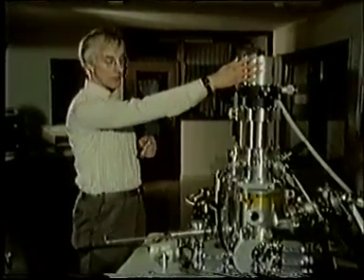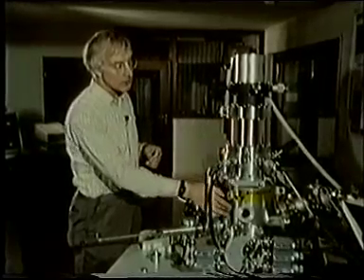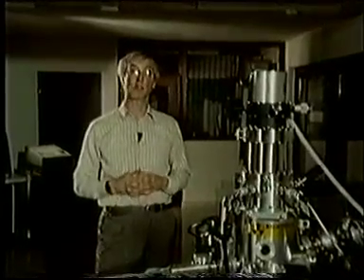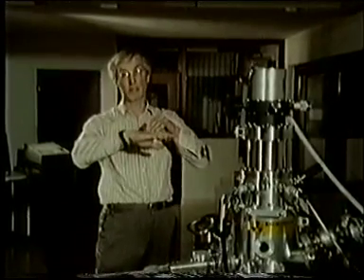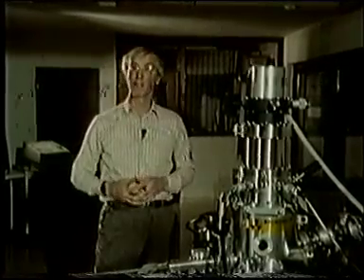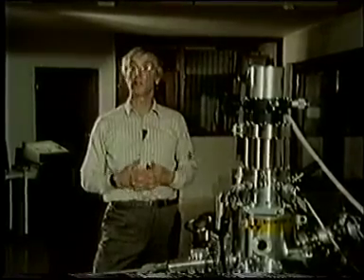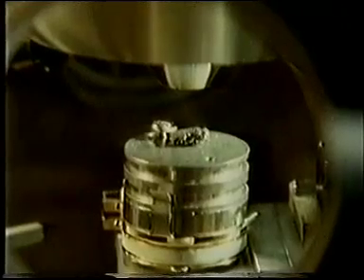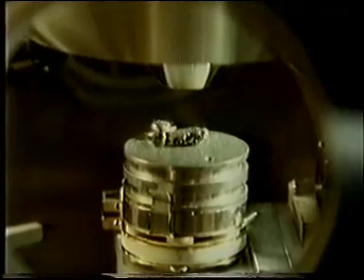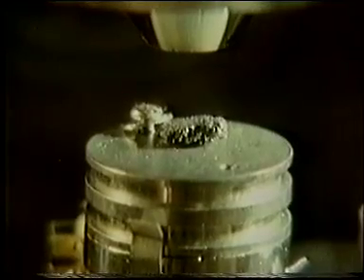Well, this is an electron gun. From here, an electron beam is fired down through this housing to the sample at the bottom. The beam induces a particular kind of electronic transition in the elements on the sample surface, an Auger transition, and each element then emits Auger electrons. But for any particular element, those electrons can only have particular velocities, and those velocities can be measured by an electron analyzer stationed above the sample. Well, a sample of our industrial catalyst is already mounted inside here, so let's see what this instrument can do.